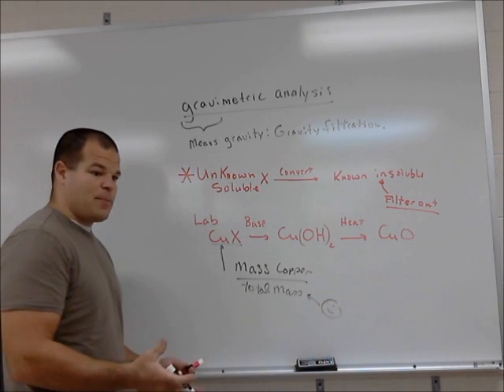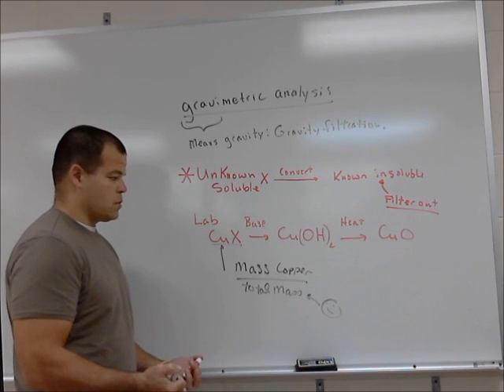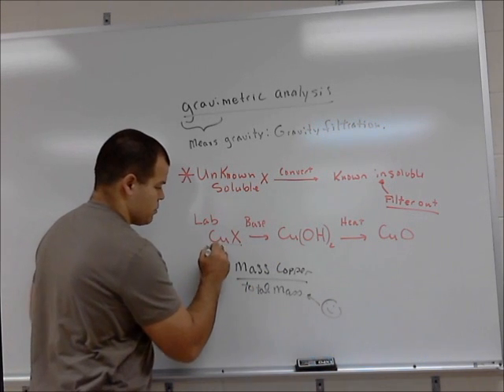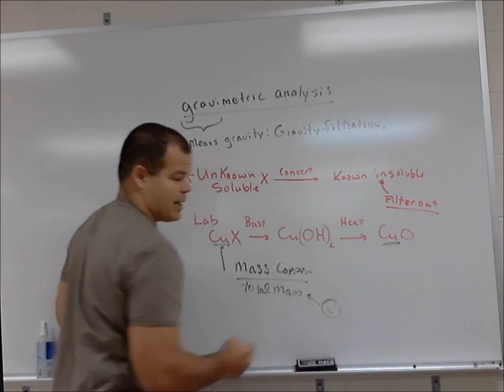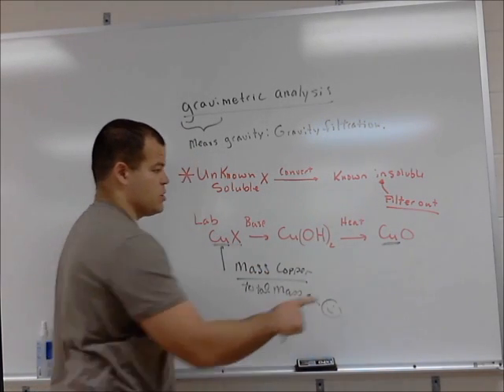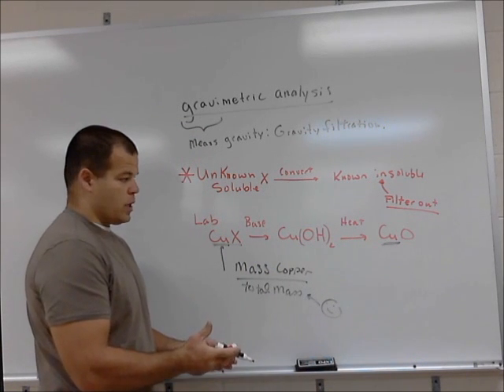Now, that sample contains copper. How much copper is in there? Okay. Now, that is what the experiment will tell us. All of the copper that was in this compound is now in copper oxide. If I had 10 coppers here, I now have 10 coppers over there. This is a known entity. It's dried. You can sample it. You can weigh it.